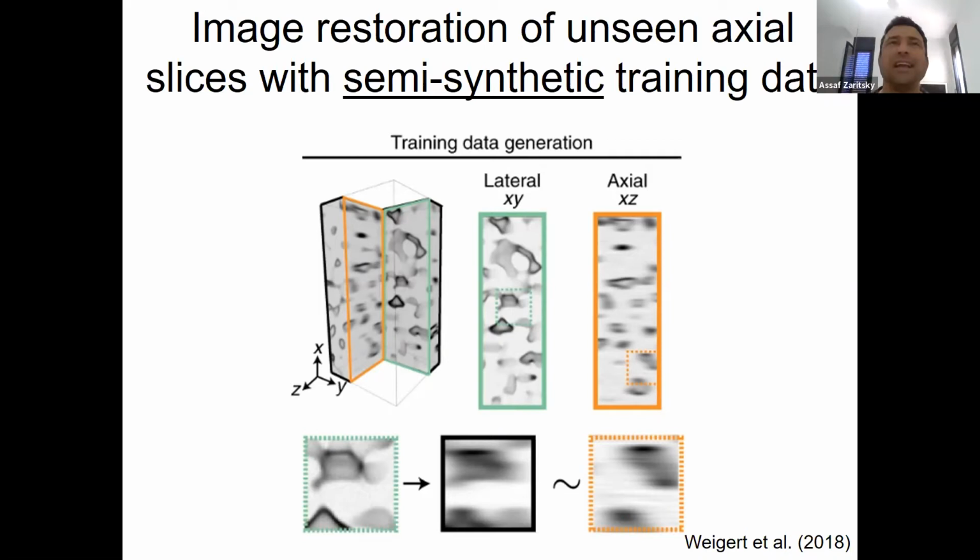We're expecting the patterns to be the same in the patterning of the objects that we see here. So the real loss of information is just because of the microscopy. And so they simulated the degradations that happen in the microscope by reducing the resolution.